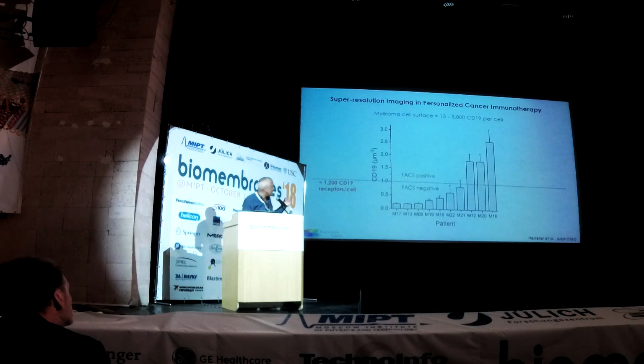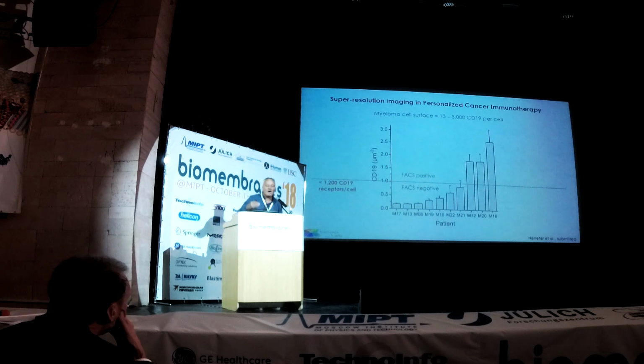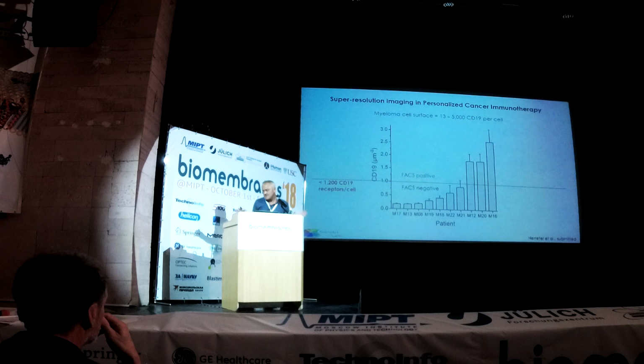So to summarize, in this first study, which we finished about a year ago, we investigated these patients. Finally, for those we could collect enough statistics to publish the data. And we saw 3 of them would have been tested positive by flow cytometry, so they can potentially receive this immunotherapy. All the others would have never received the immunotherapy because they are FACS negative in our hospitals, but they express these receptors.